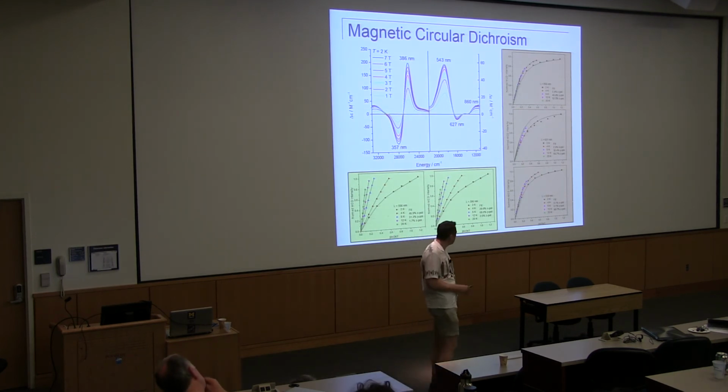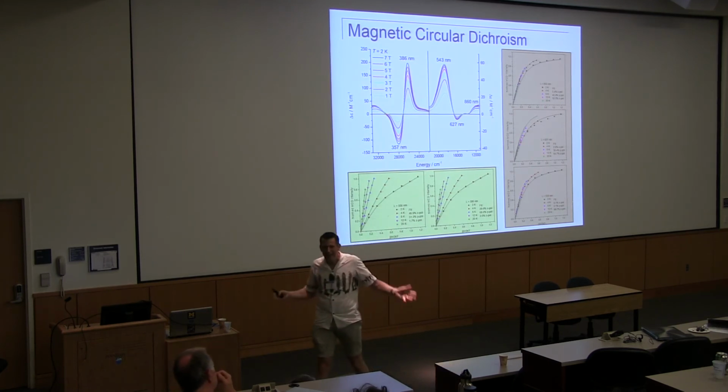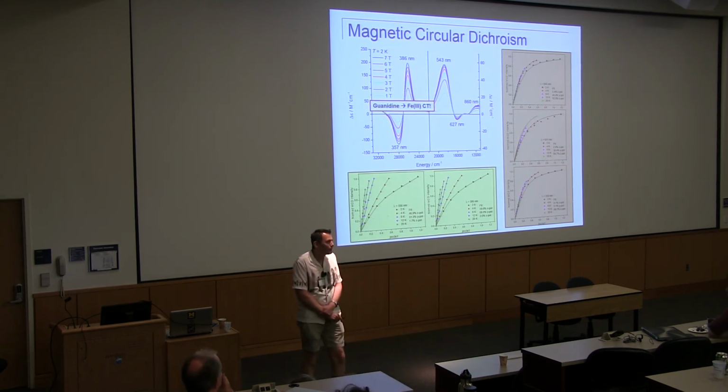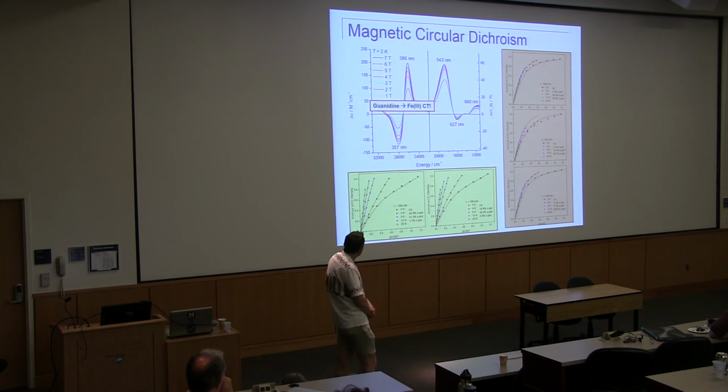So these are charge transfer transitions from the guanidinium co-ligand to the iron center. They're not related to the NO. Those are, in a way, spectator charge transfer transitions that we observe in this region.